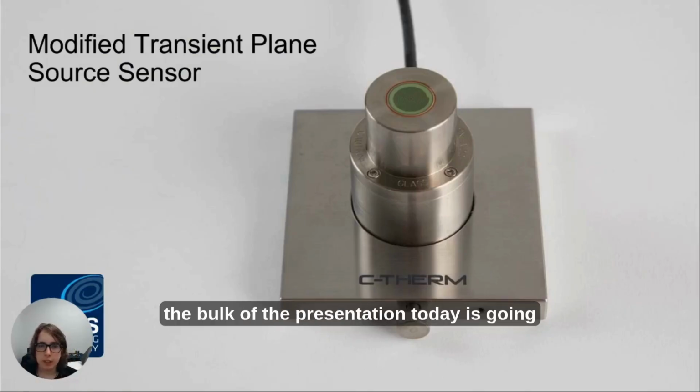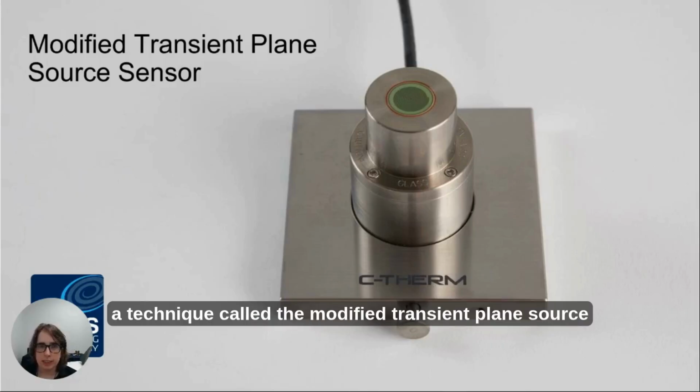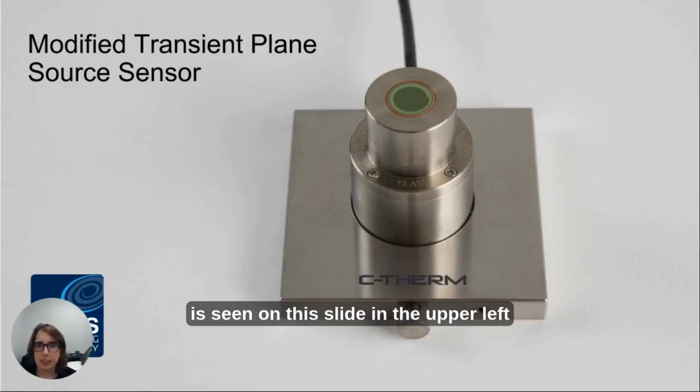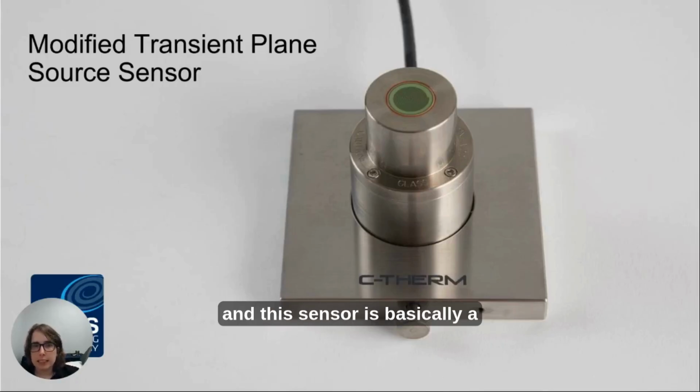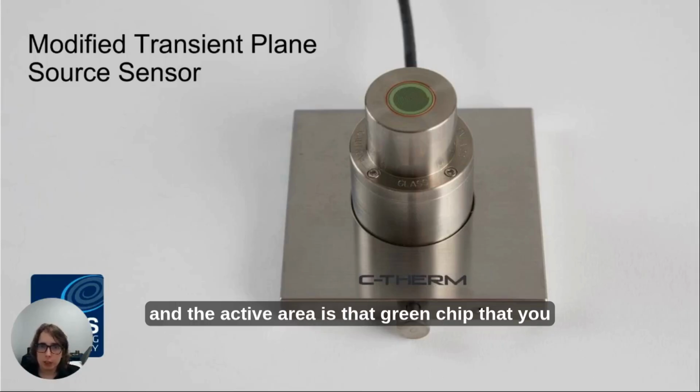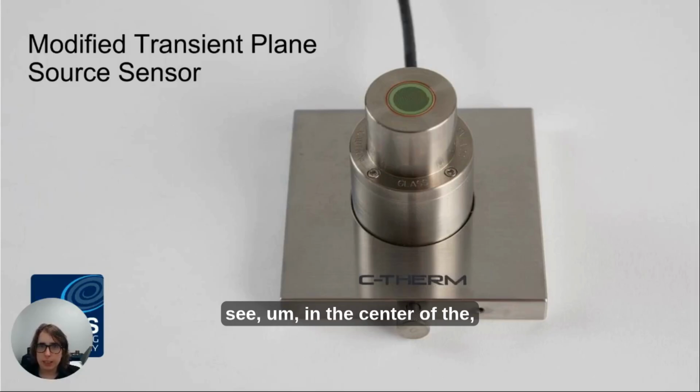So the bulk of the presentation today is going to focus on a technique called the Modified Transient Plane Source, or MTPS technique. The sensor for this technique is seen on this slide in the upper left there. And this sensor is basically a single-sided interfacial sensor, and the active area is that green chip that you see in the center of the sensor area there.